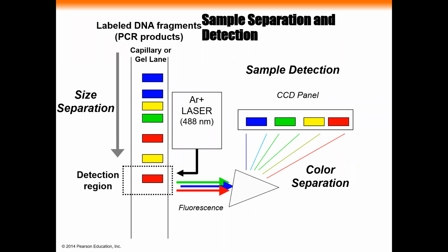I'm trying to think of the best way to explain this without getting too complicated here. What this slide is showing is that there are specialized polymerase chain reaction machines where you can put fluorescent dyes in the DNA, and if it shows up, a detector says, oh, you got it here. And in this region, you have this amount of DNA, or this amount of the repeats in it, the STRs.